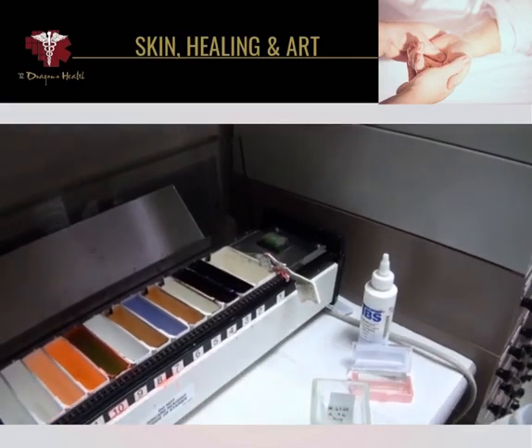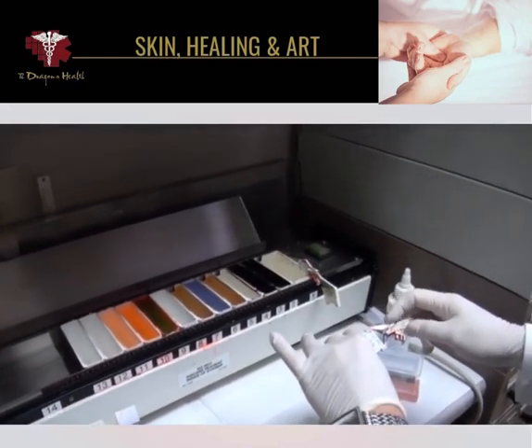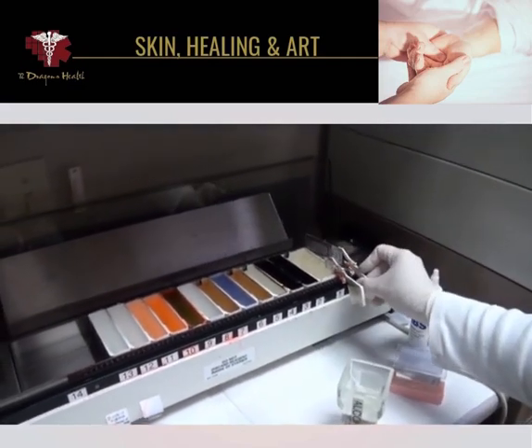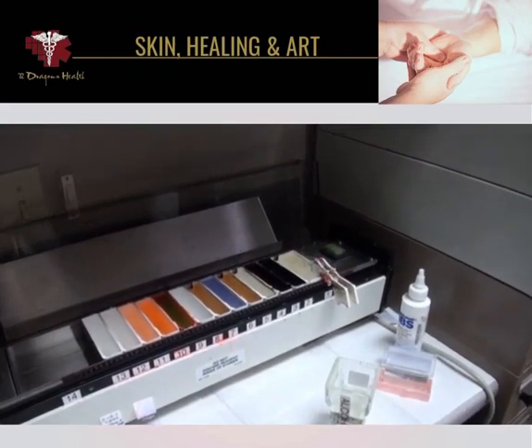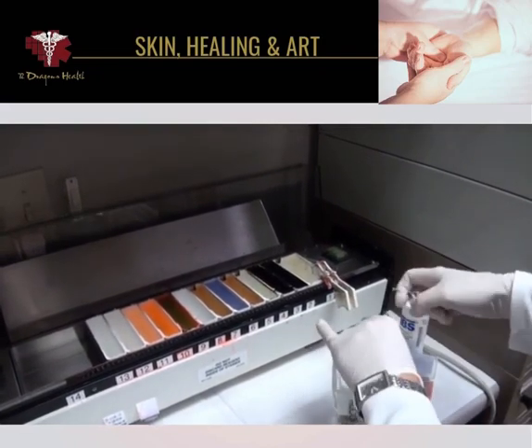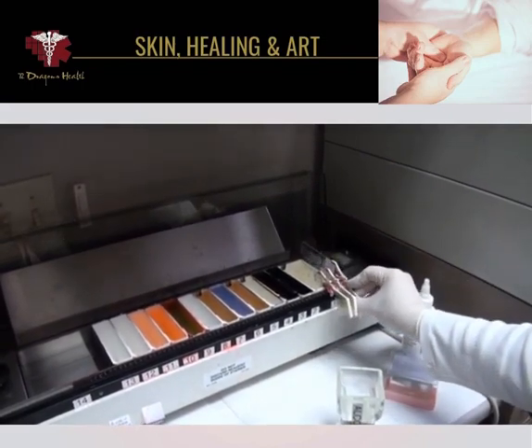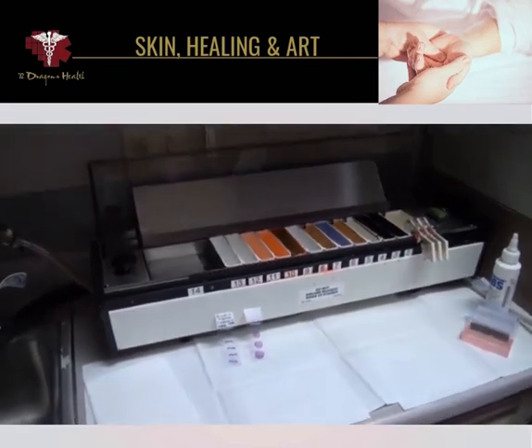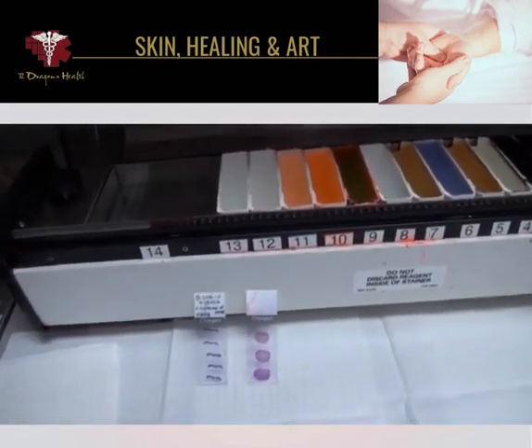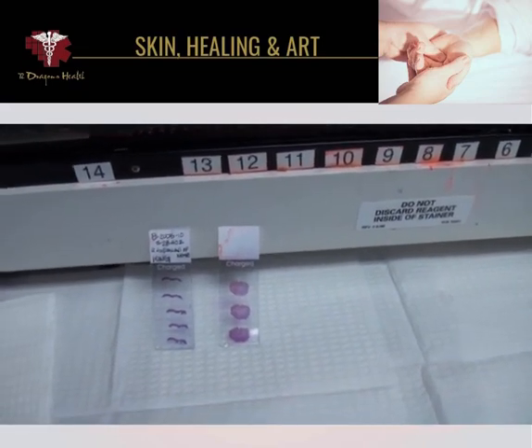The slides are then placed on this stainer that sequentially goes through a process where the tissue is stained so that you can differentiate cancer cells from normal tissue. The staining process takes place, and in the end we will end up with microscopic slides that look like this.